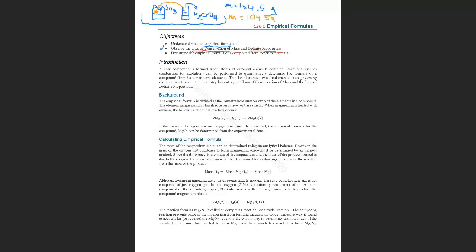When I have a chemical reaction, the atoms rearrange. Let's say in our experiment, I will have magnesium that reacts with hydrochloric acid to produce magnesium chloride plus hydrogen.